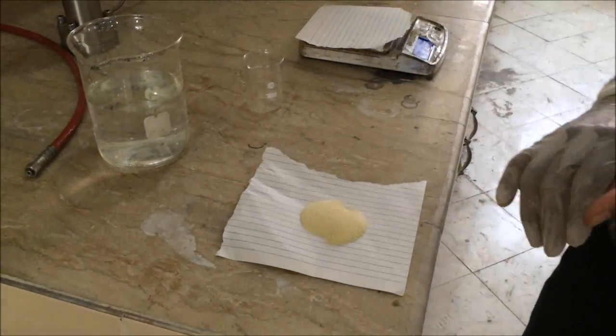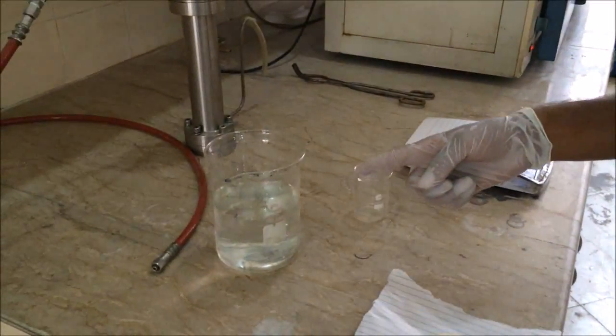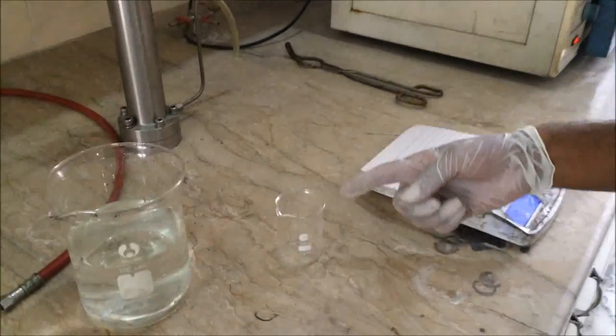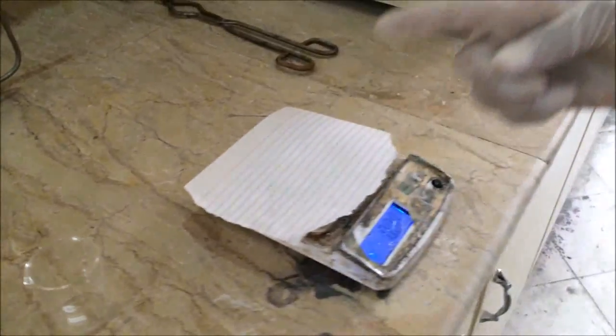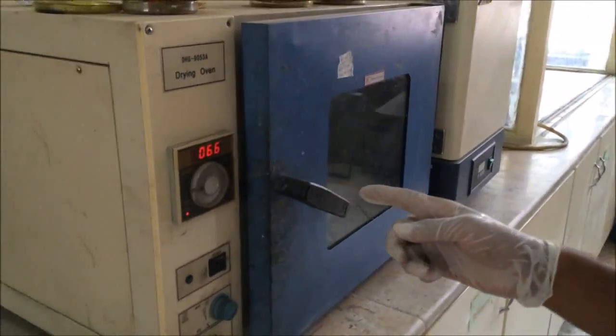For the preparation of gelatin, we are using gelatin powder, distilled water, a beaker, a weighing machine, and a drying oven.